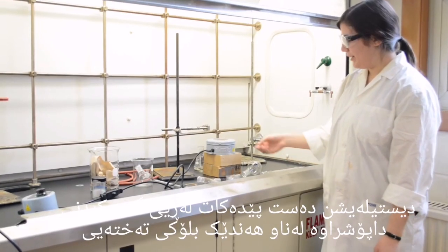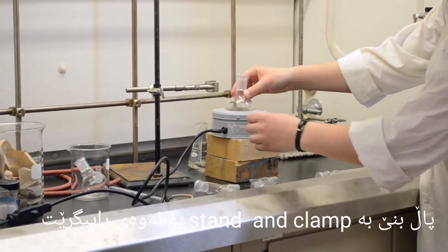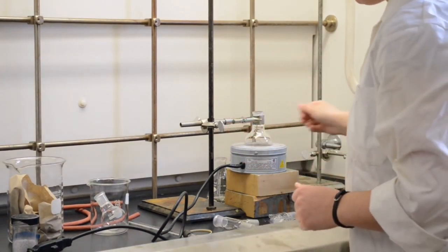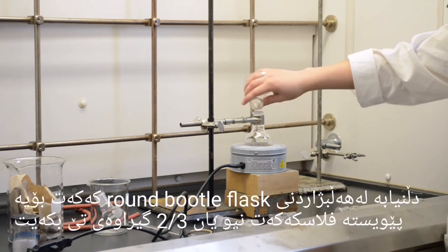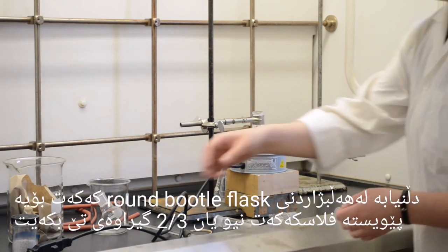To set up a distillation apparatus, first place a heating mantle on some wooden blocks to elevate it. Put your flask in and clamp it. Then you should add your mixture of liquids with different boiling points. Be sure to choose a round bottom flask so that your flask is only half to two-thirds full.